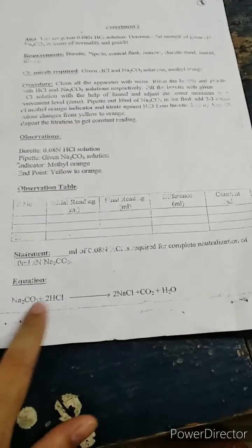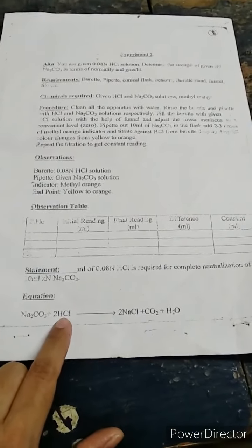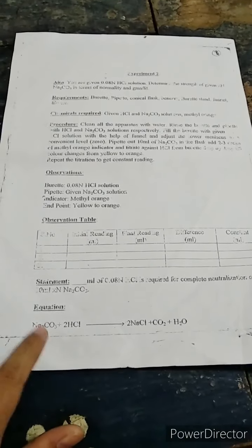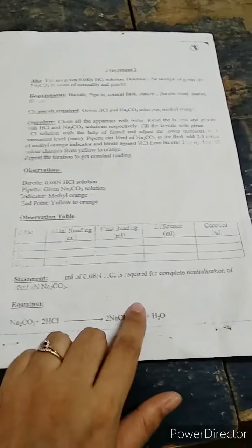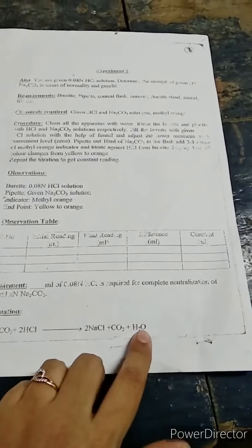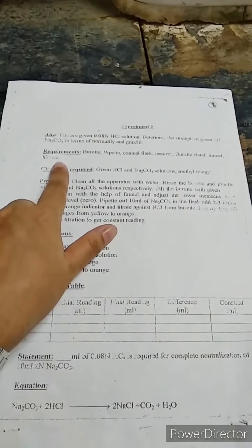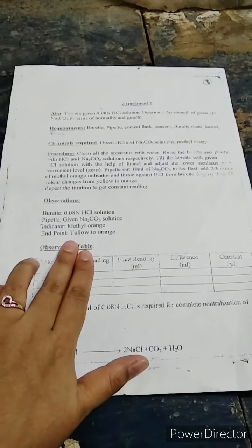Let us see the reaction once. We are given the strength of HCl, which is 0.08 normal, which is to be titrated with 10 ml of this basic solution, Na2CO3, sodium carbonate, which produces our common salt NaCl, CO2, carbon dioxide and water. These are the requirements. We have seen all this apparatus in our earlier experiments also. Let us move to our observation part.